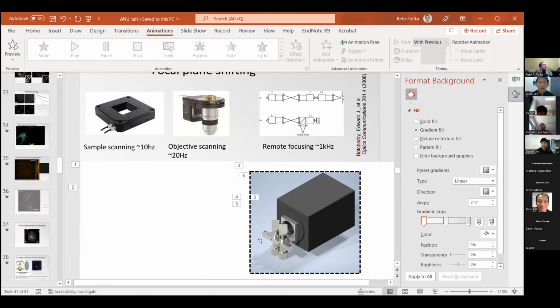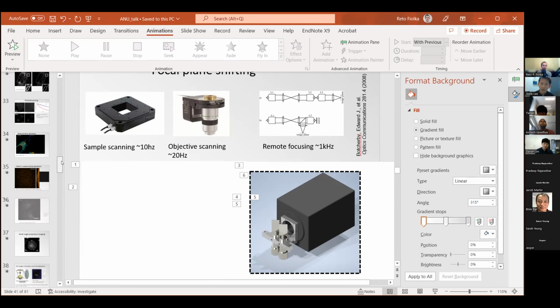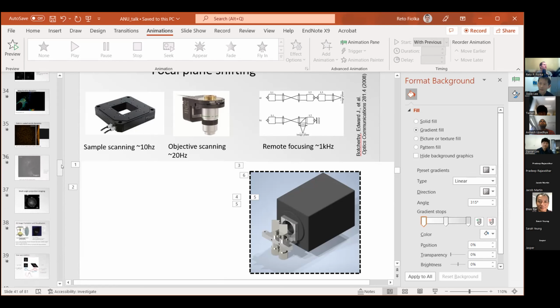Triggering that optically. So the last question would really be on polarization. How well is the polarization maintained? So if we are to use that, the rotator. Yep, the rotator. And yes, that is a very interesting question. Experimentally, it rotates the polarization, but the extinction ratio gets poorer. So it not only rotates, it also depolarizes it, depending on the choice of mirrors. Yep. To my shame and horror, I have not done the math for different mirrors like dielectric or silver coated, what it actually does to the polarization. Empirically, it rotates in the right direction, so that's the positive side.